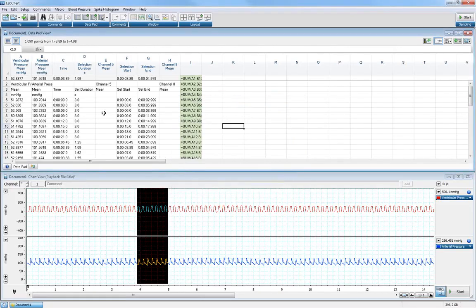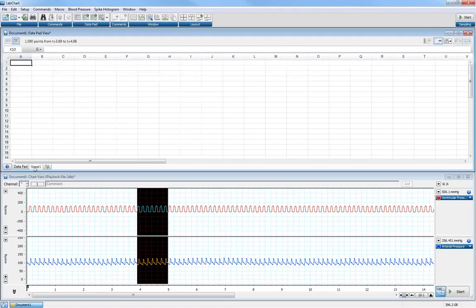Okay, so that's basically all the little features of the datapad, except for adding new sheets. Just as in other spreadsheet programs, we can add new spreadsheets to our datapad. We do this by clicking on the Create Worksheet button down the bottom left-hand side. That creates new worksheets with the default names of Sheet 1, Sheet 2, and these additional sheets can be used for performing additional calculations on your data.